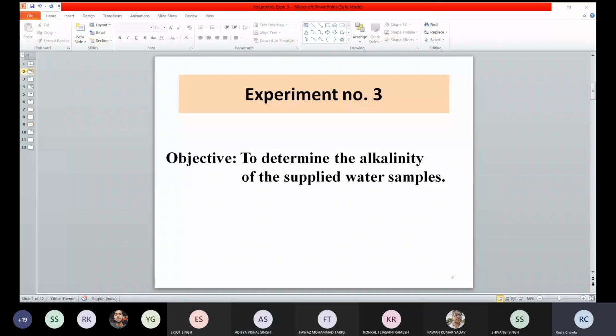I've shown you the scale in the enlargement impact. There are two types of division, the bigger division and the smaller division. So which divisions are you talking about? Do you remember the scale?